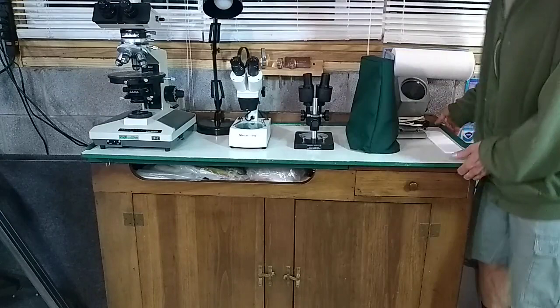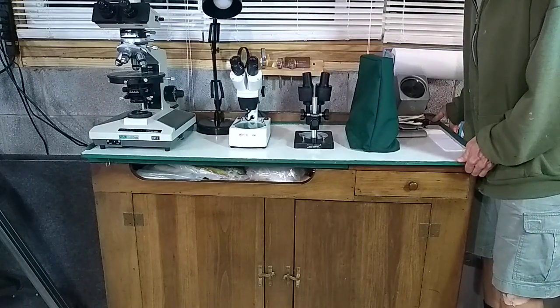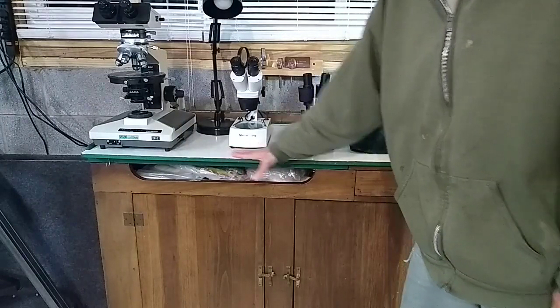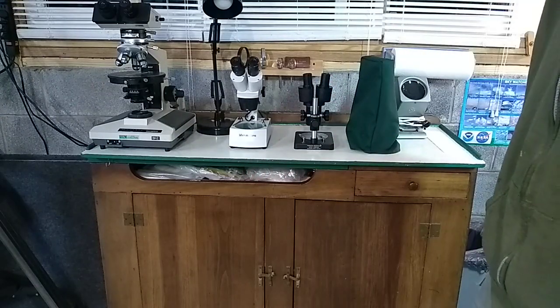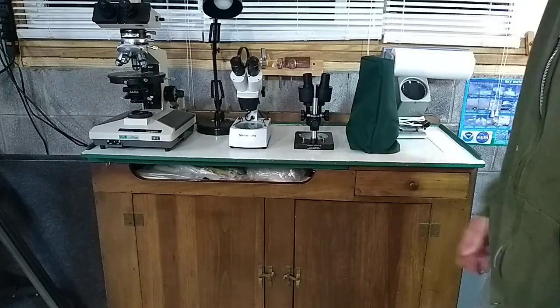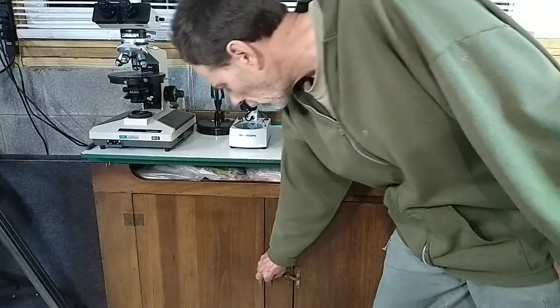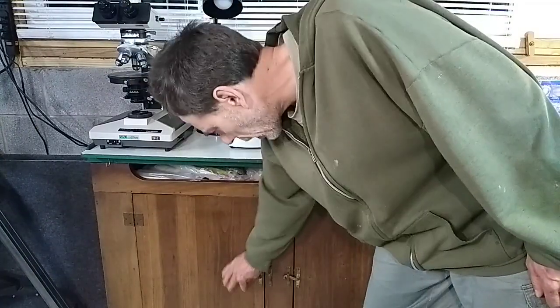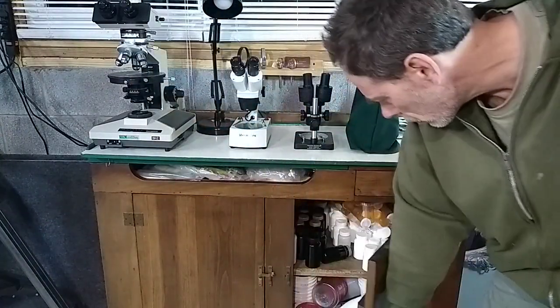But I modified it to have a flat lid that covered the whole thing, so I have a work surface. And I use it as my microscopy bench. But any sort of cabinet that had a flat top would work out the same. It does have nice storage. I store basically bottles and jars, sort of containers.